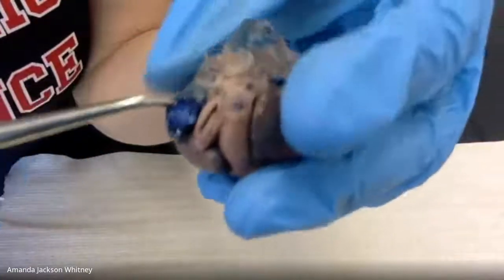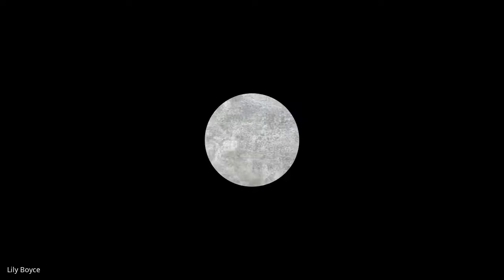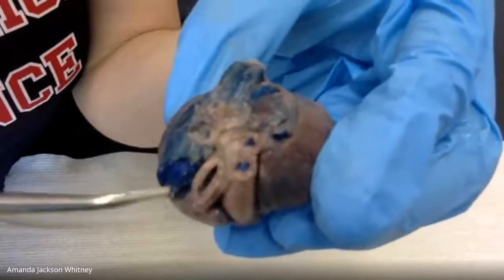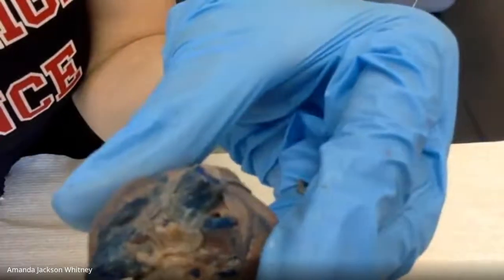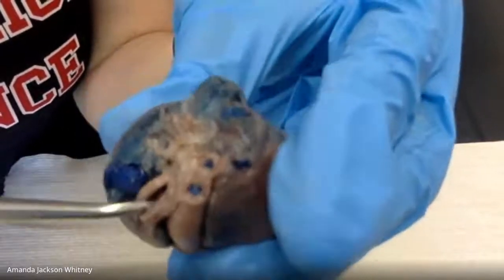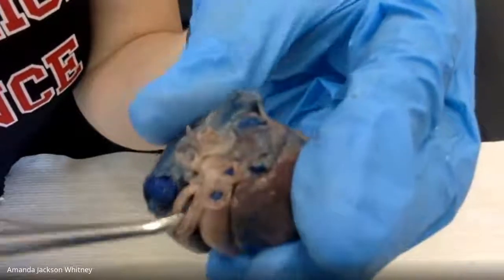But what are some of the other differences between arteries and veins that we know? So like our left would be the vein, and the right would be the artery, because the arteries are thicker, right? Good. Yeah, exactly. So this right here is the aorta that's coming up and out of the heart. Look how thick that is, and that's really thick because it needs to withstand all of the what? Of the blood.